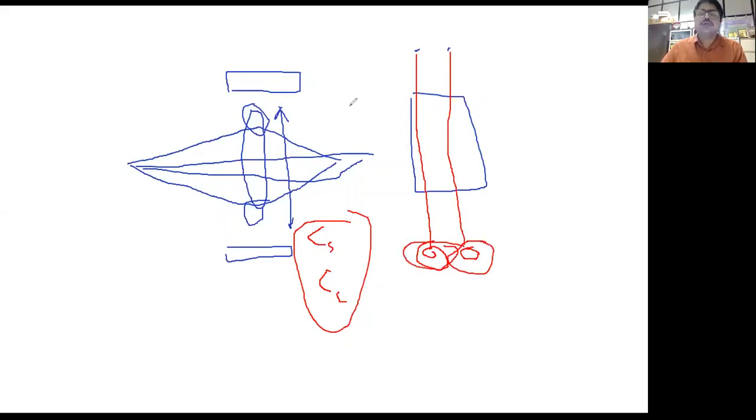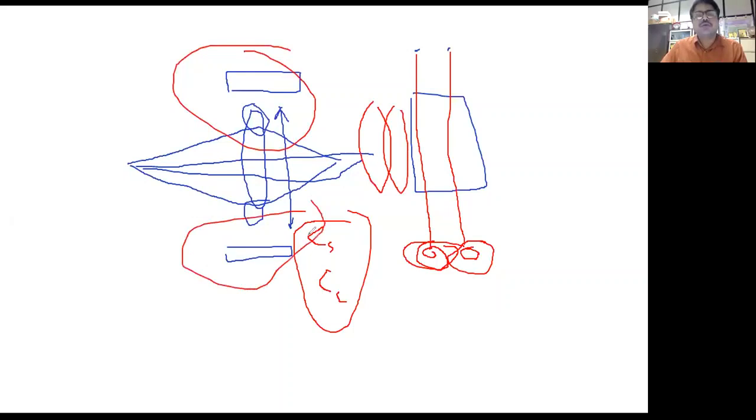There was this German mathematician, Scherzer, it's called Scherzer defocus. He gave a formula, and he designed actually the corrector. So what electron microscopists do, they put another set of complex lenses here, because you cannot perfect these lenses beyond a certain point. You put corrector lenses, an additional part. And that is basically another 10 crore rupees. So it is an expensive question actually.